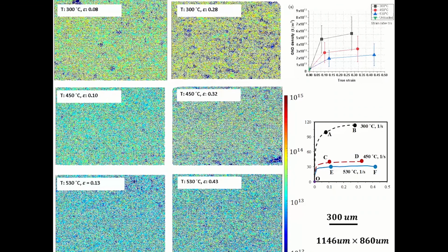Oh, okay. Currently, we have MTEX, which is developed. I think it is ready to use on the website, and we are currently one of the groups using this to calculate the GND dislocation density. But regarding the lattice dislocation, I'm not very sure about it. Okay, fair enough.